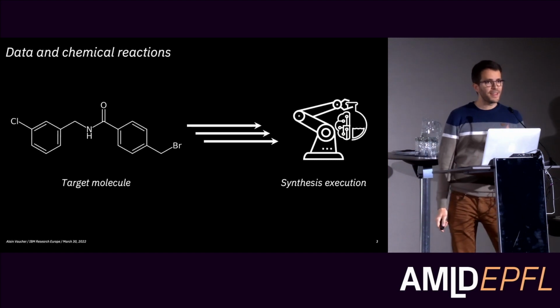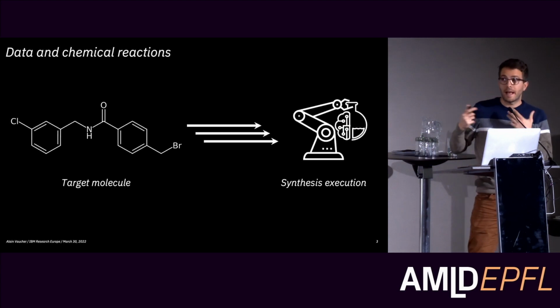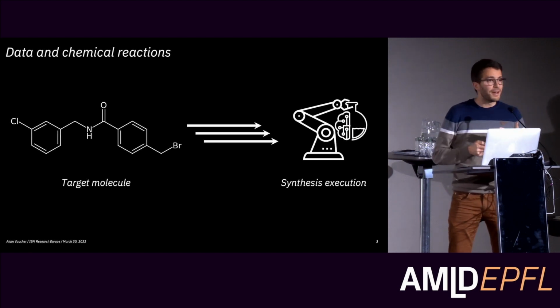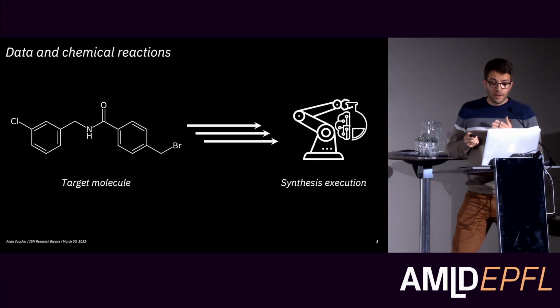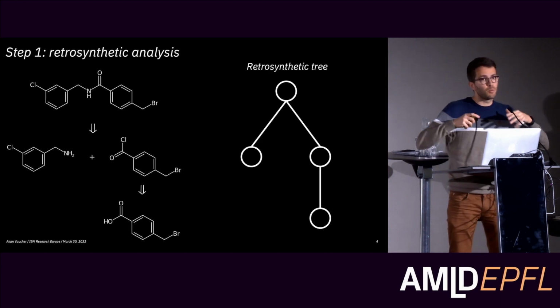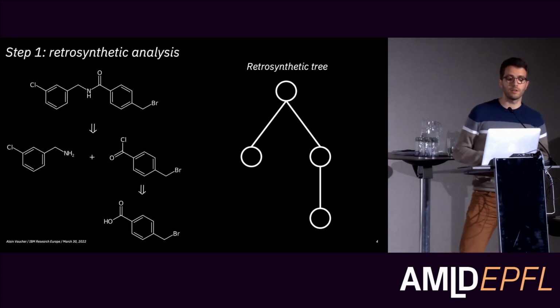What we have been aiming at is a setup in which a user or even an algorithm comes up with a compound and its synthesis is then launched automatically in the lab. And in this scenario, the chemist can even launch the synthesis from home. The whole pipeline can be split in 3 steps, which I will describe shortly in the next few slides, before then going in more detail later in the talk.